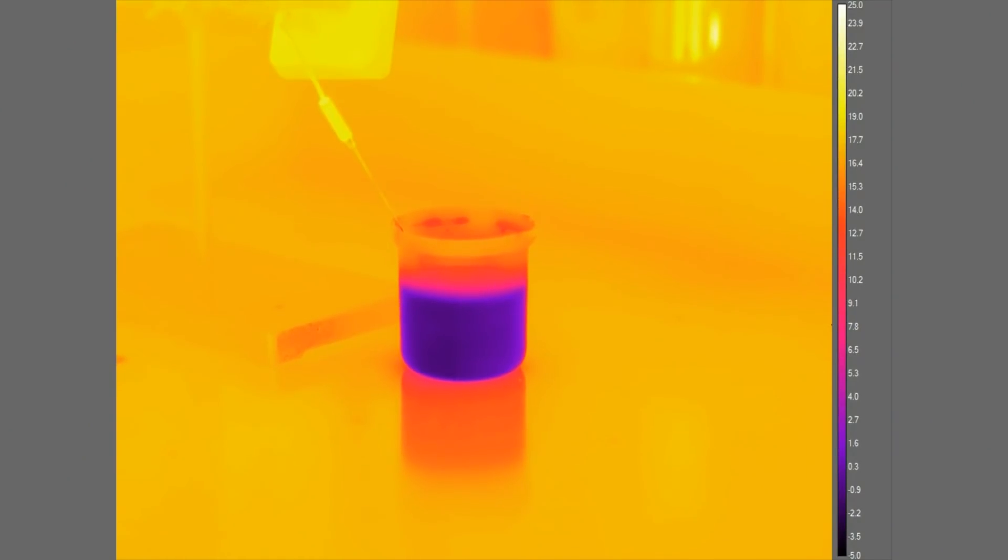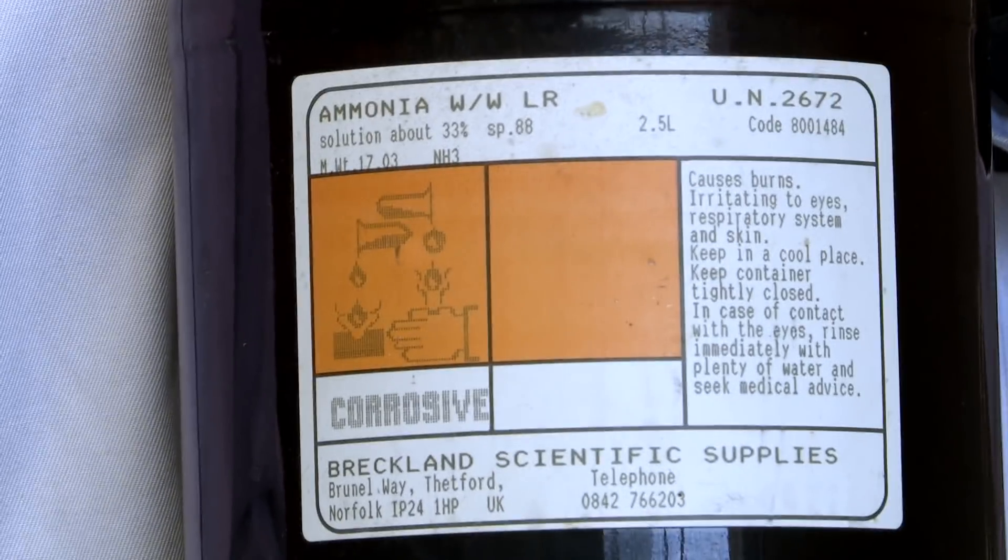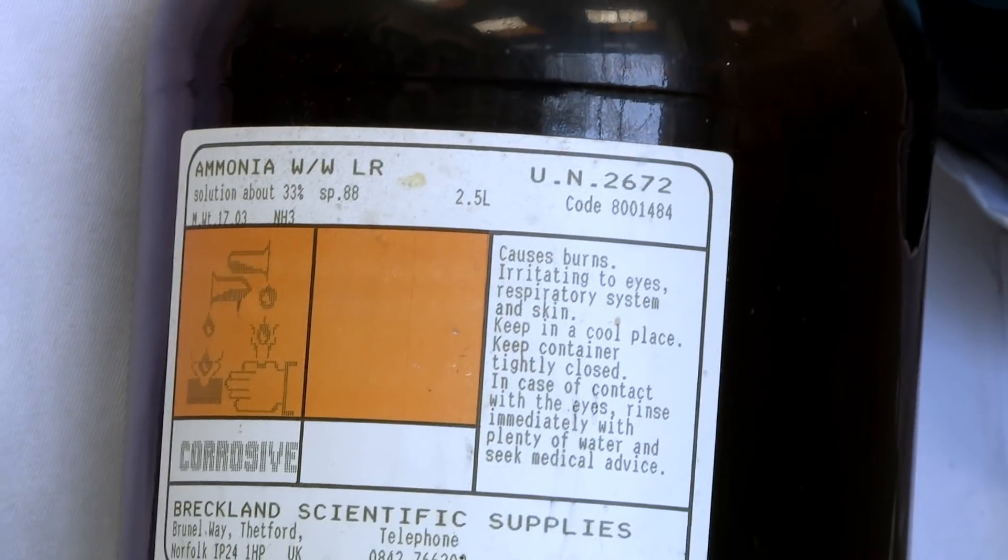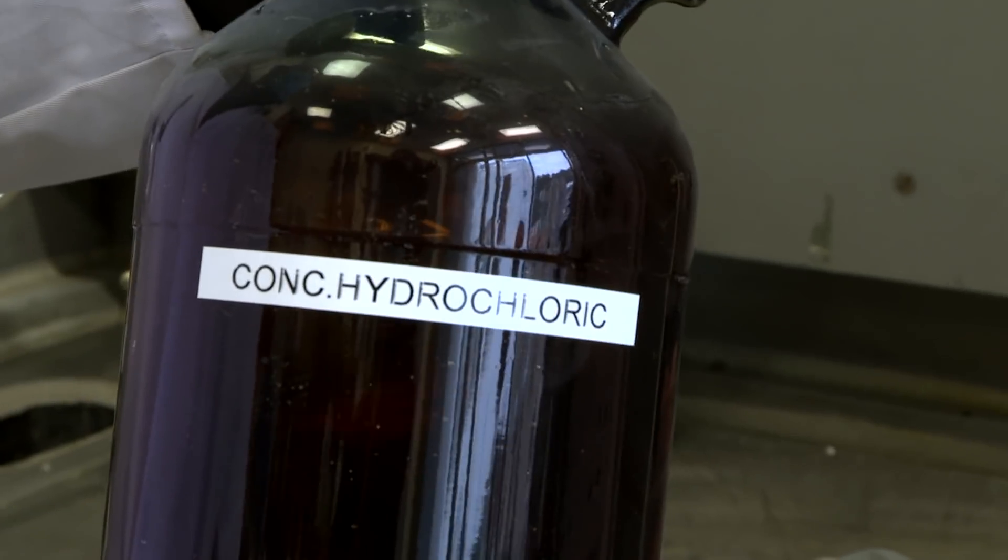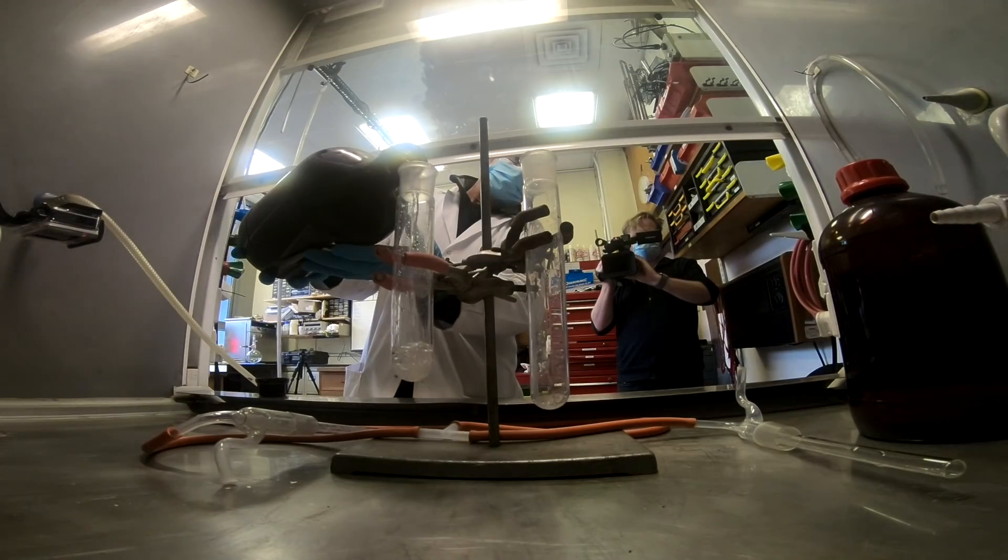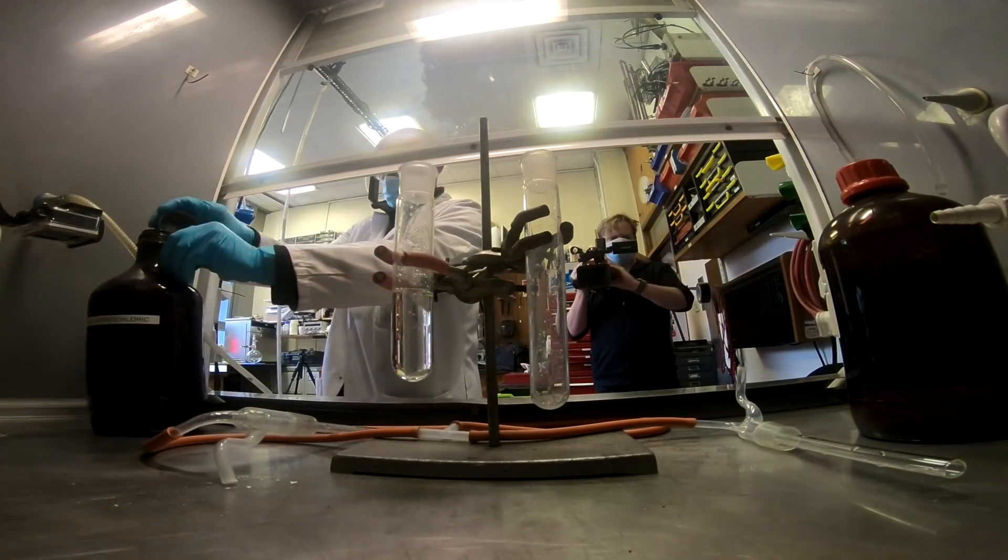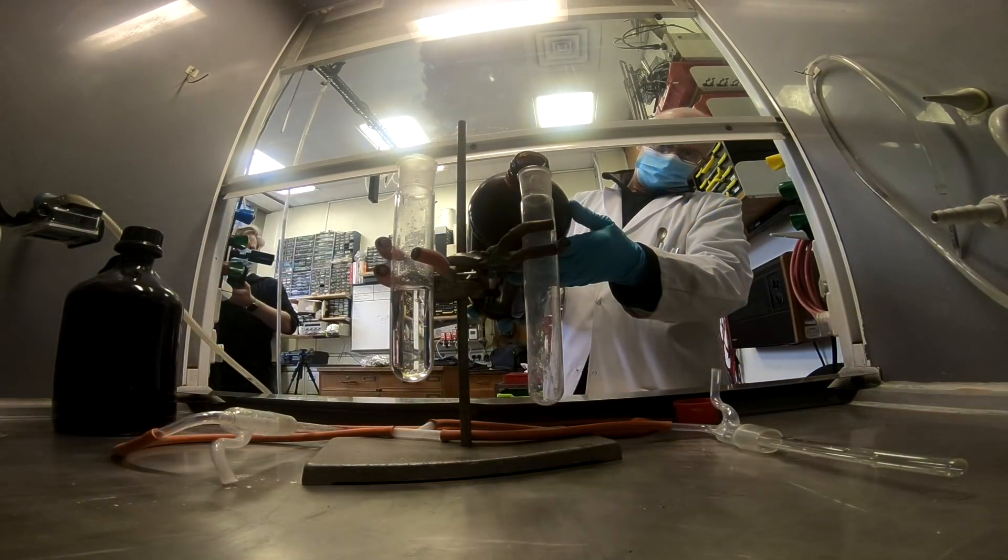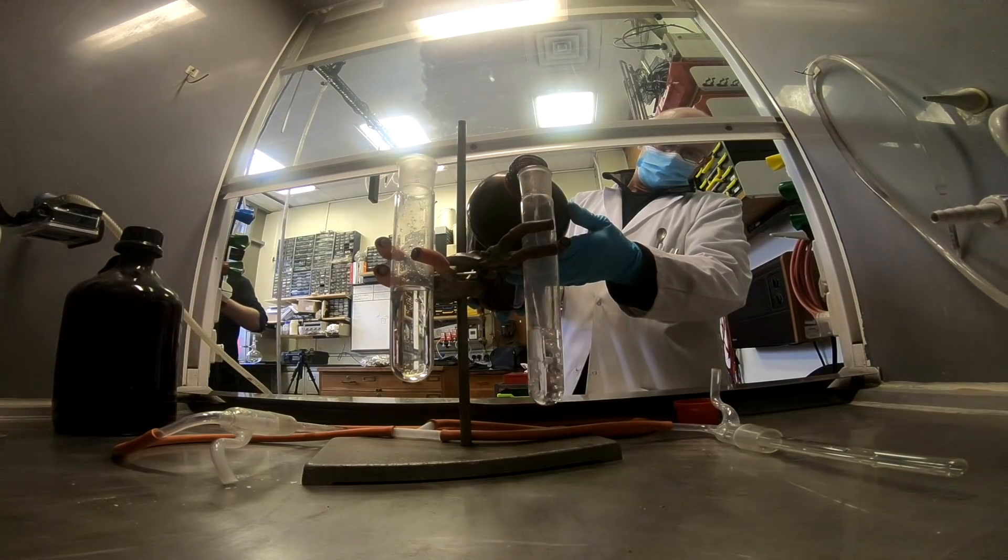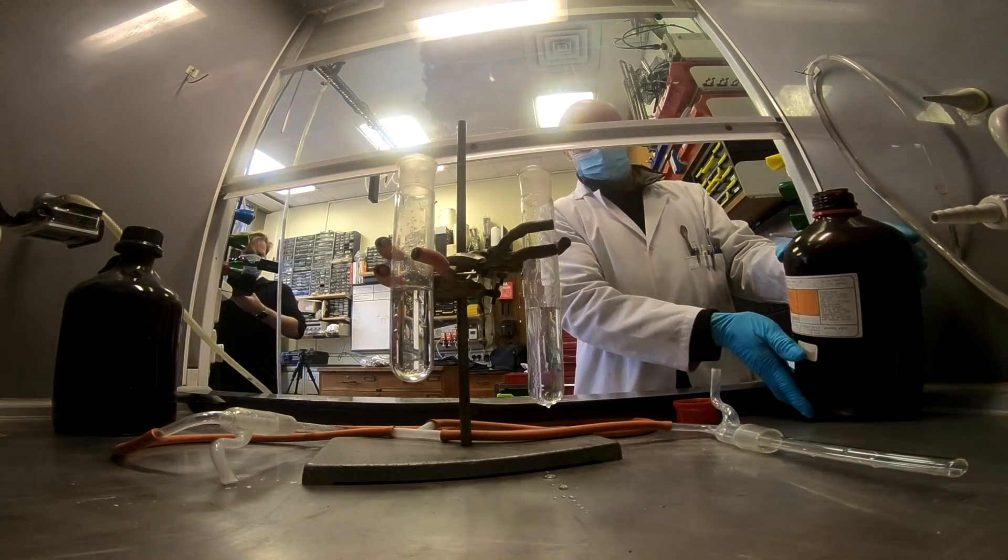The thing that people really like with ammonium chloride is making it from ammonia and HCl gas. And this is a reaction which from time to time has been proposed for making smoke screens for naval ships or warfare.